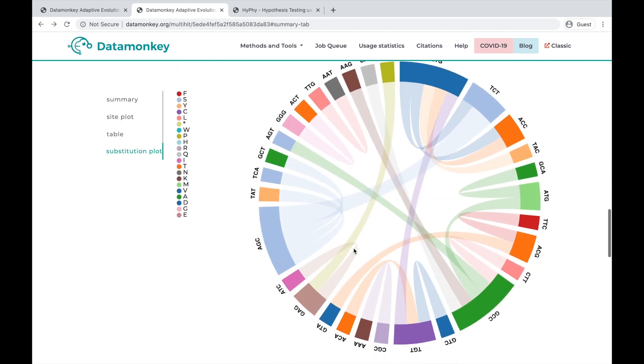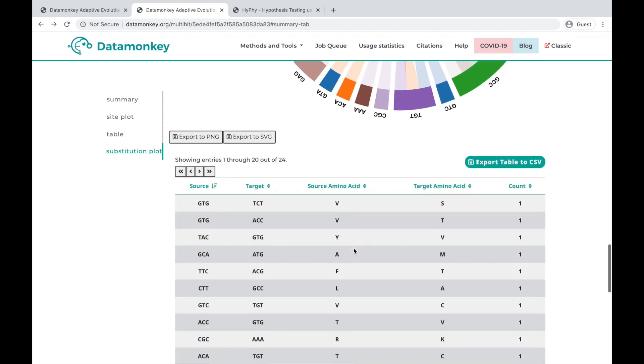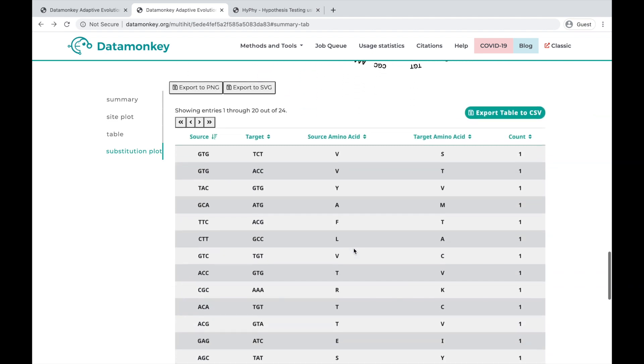So below this plot, there's also a table which tells us the source codon and the target codon, as well as the source amino acid and the target amino acid, and then the number of substitutions that fall into each of these categories.